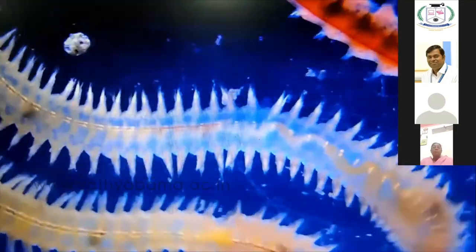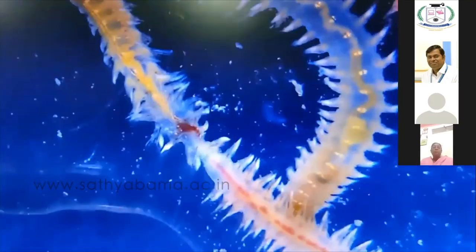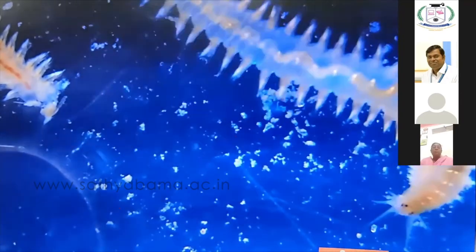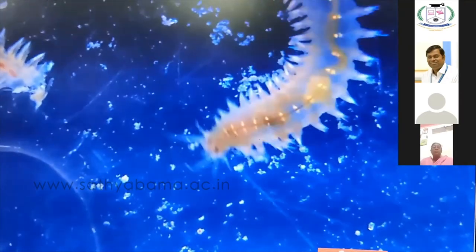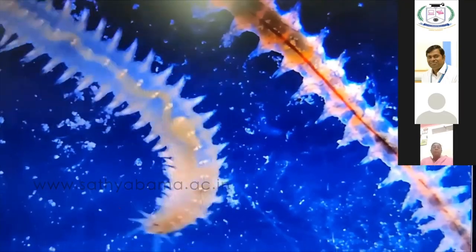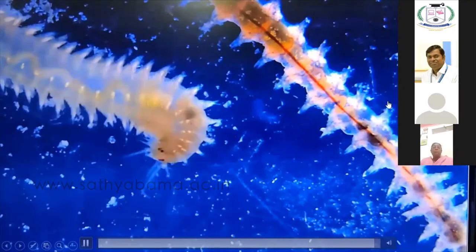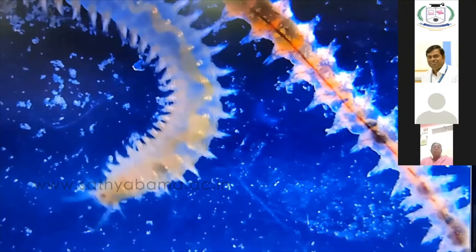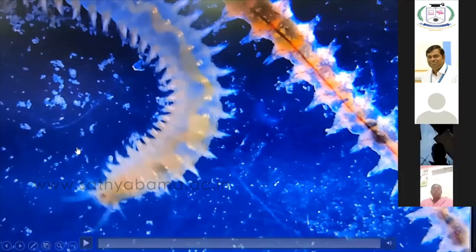Actually, unfortunately, this worm was cut due to the transport. You can see the food particles inside the stomach here. We have some other videos on how to remove the food particles from the stomach, and another video on how the eggs are laid from the body. We have several videos. I will share them on the next occasion from this presentation. Okay, next.